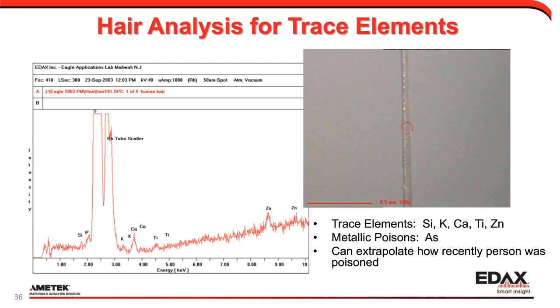Because the hair grows over time and uptakes certain kinds of elements, you can potentially tell, as you go along the length of it from the root on out, when exactly somebody might have been exposed to whatever was taken up in the hair. As I was doing this, I was also wondering whether the same kind of phenomenon might take place in fingernails or toenails. I really can't say, but I just thought it was an interesting possibility.